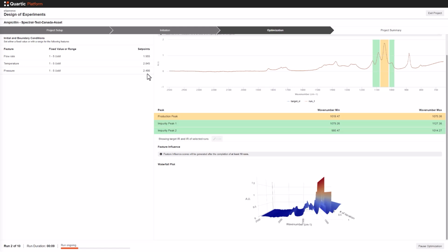If we don't have that, that's perfectly fine. We'll just run the experiment, get those results, feed them back into the optimizer, and then recommend the operational settings for the next run or the next time interval and continue to iterate through.